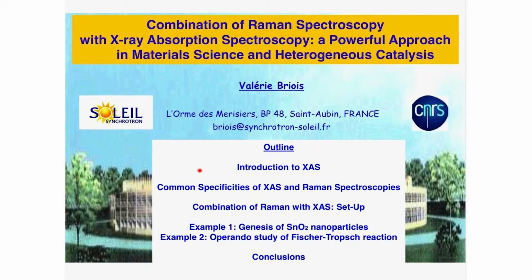After a short introduction to X-ray absorption spectroscopy, I will discuss the common specificities of both techniques, and after that I will present how this combination of techniques can be carried out. And finally, I will illustrate with two examples belonging to my own research the complementarity of these techniques in the field of sol-gel chemistry and in the field of heterogeneous catalysis.